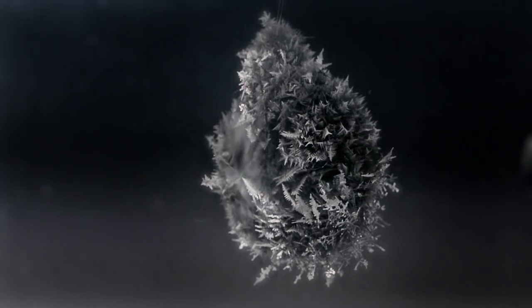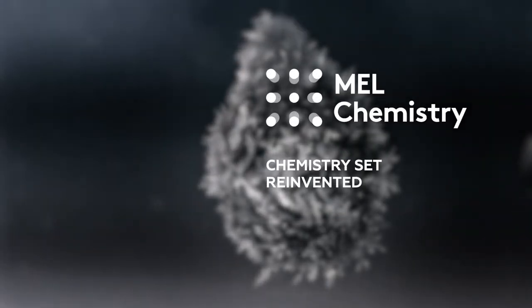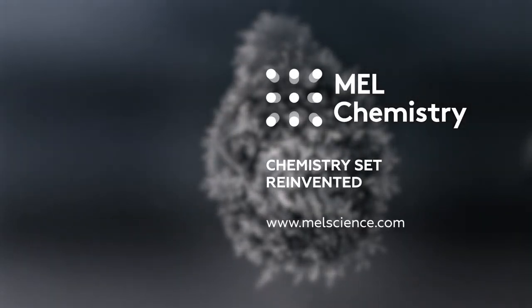You can use a macro lens to take a detailed photo of the hedgehog. Learn more about this experiment on our MEL Science website.